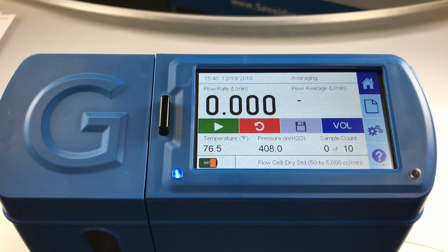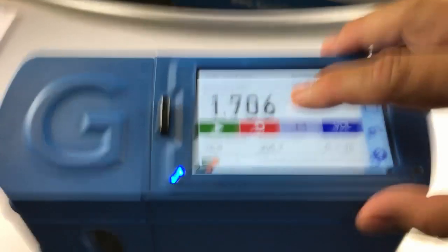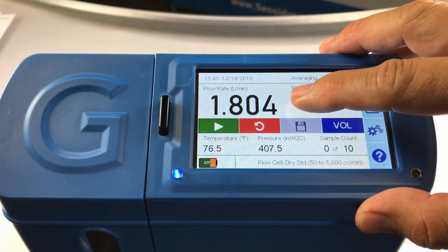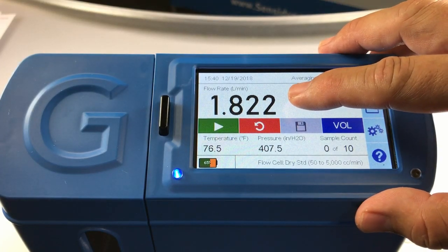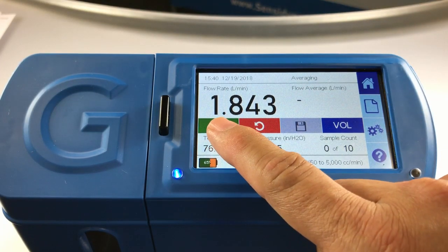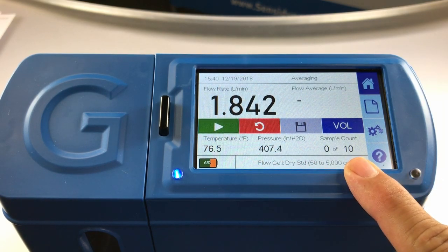The next step is to begin the airflow on your GillAir Plus in calibration mode. Once you begin seeing the live readings stabilize on your home screen, you will want to hit the play button to collect your 10 sample count.